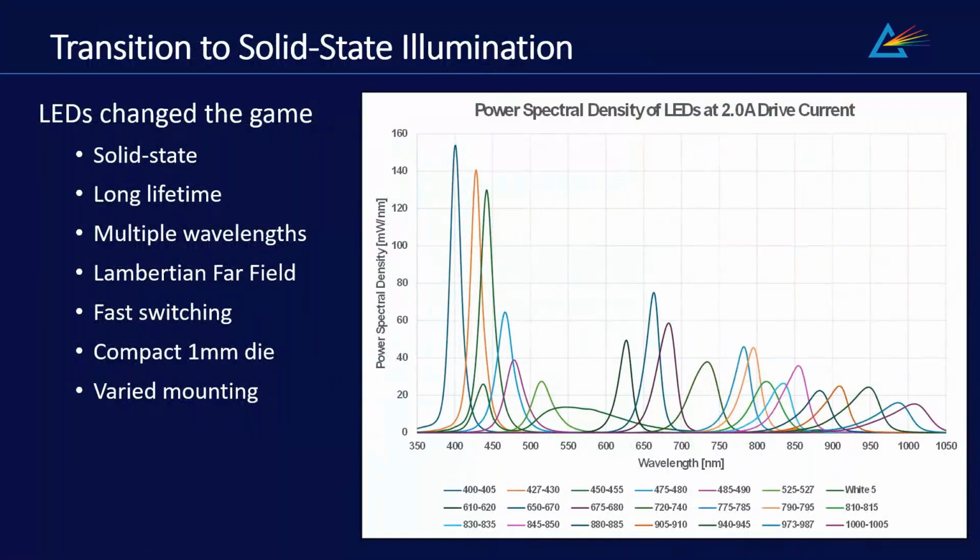These optical, spectral, and thermal challenges and lamp limitations are what drove the development of modern multi-channel LED illumination architectures. LEDs introduced reliability and control, and they enabled entirely new illumination systems. There are now numerous LED wavelength and power bands available, from lower UV through SWIR, and improvements in optical power output and reliability continue.